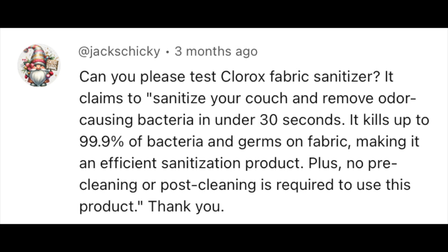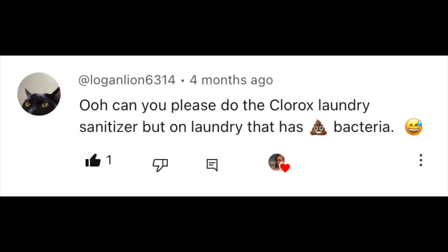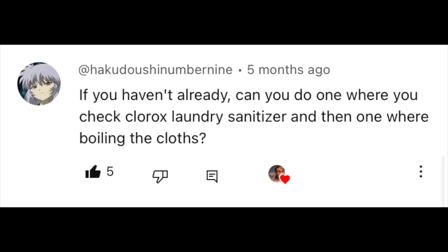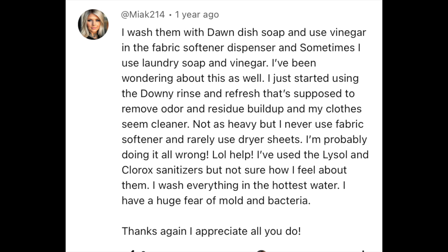This video is a viewer request. In order to test how well this Clorox laundry sanitizer works, I am going to take some white cleaning cloths and wipe areas around my home where I know I can get a lot of bacteria.